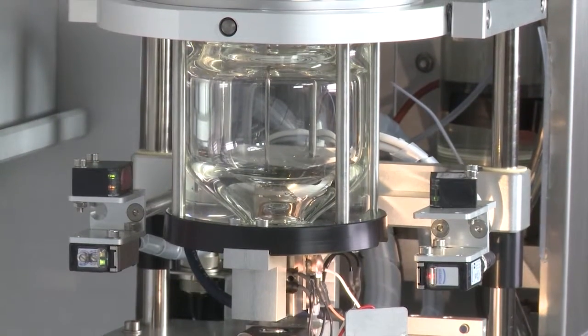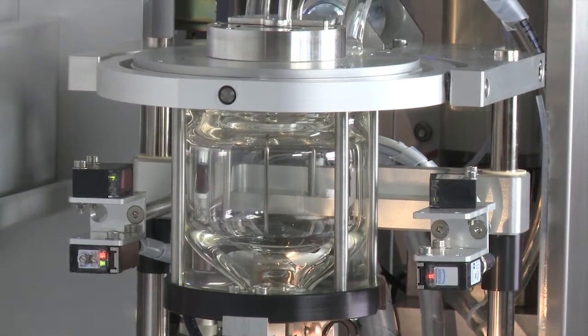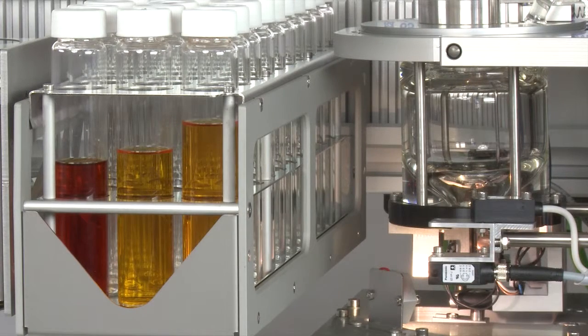Here you can see the movable sensors. These are used to achieve a reliably defined end volume, in our example 3 milliliters, and prevent the overfilling of the chamber.